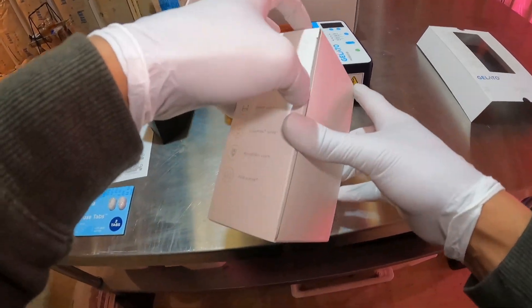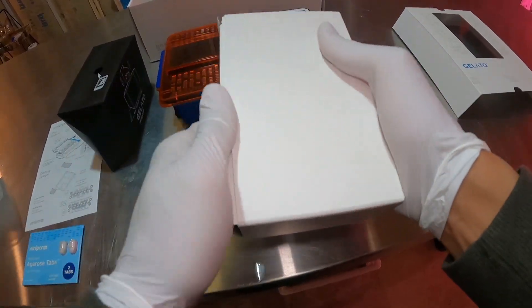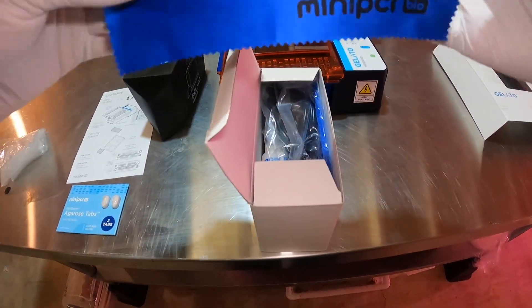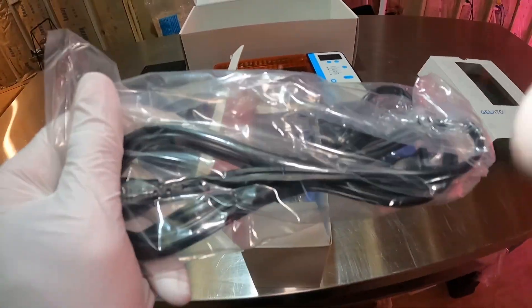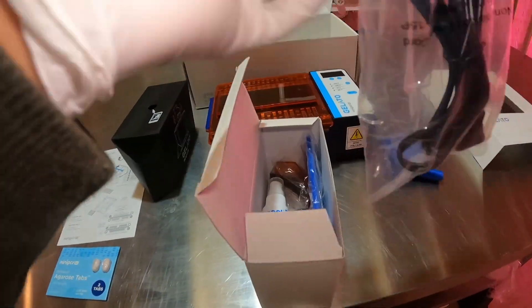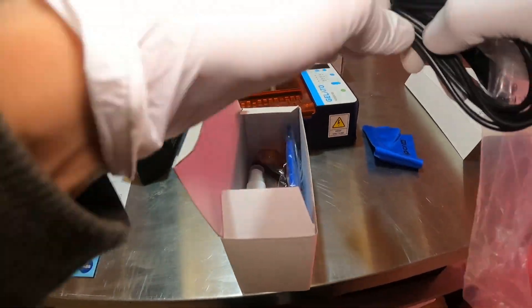In this little box is where we have the power supply, and there are a couple other things in here. We got a nice little cloth here to wipe off our screen. After I run a gel, I like to take the orange lid off and wipe it because there's a little bit of condensation that builds up, so it gives me a better view of the DNA bands.